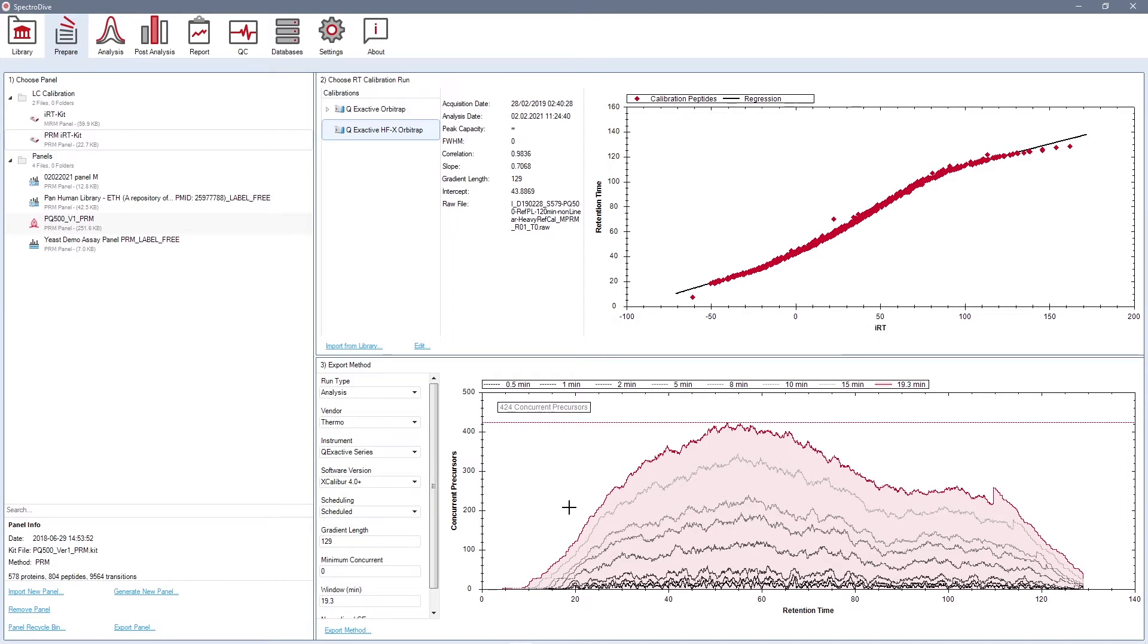SpectroDive will save your method as an instrument acquisition software-ready transition list. Once the PRM runs are acquired, you can continue with the analysis in the analysis perspective.